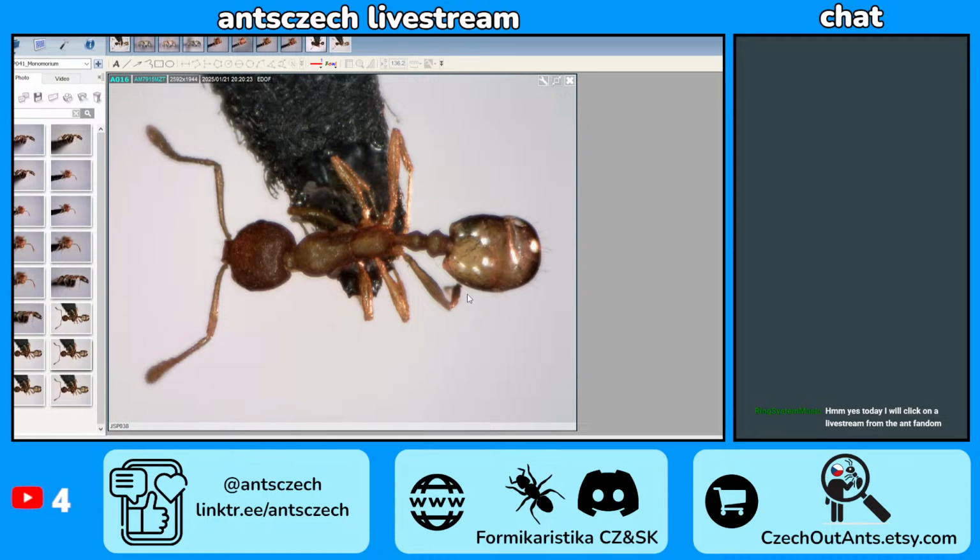That's great news. It looks like the specimens are now soft, so I can reposition them. But the question is if they came off the pin or not. Oh, nice. It looks like they did. Let's go.